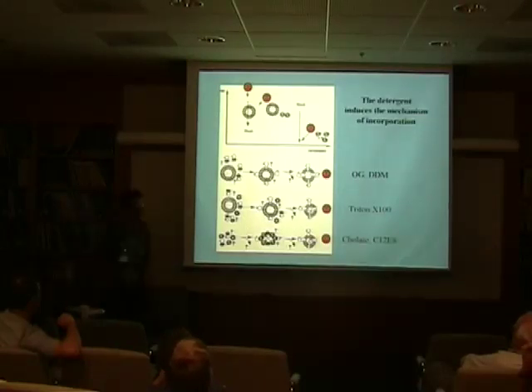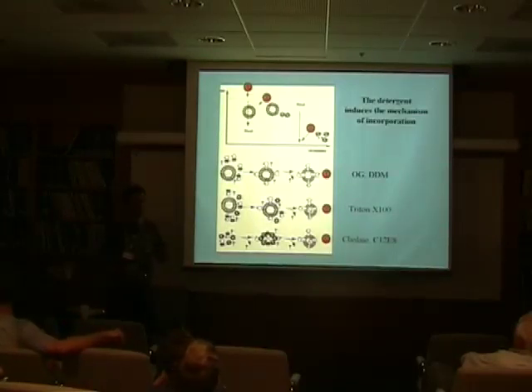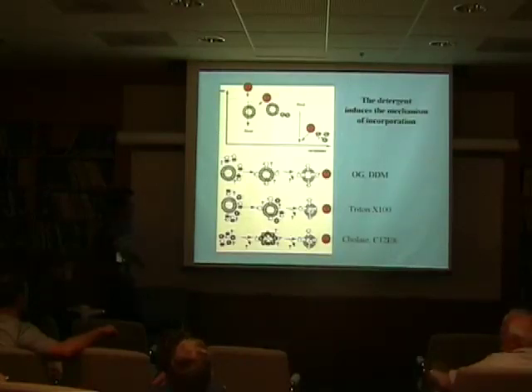Actually, most of the data that we have on the reconstitution process involving the protein come from the reconstitution of high lipid-to-protein ratio samples in the functional state. So we know that there are mainly three mechanisms of lipid-to-protein association. Those mechanisms are dependent on the detergent that is used.